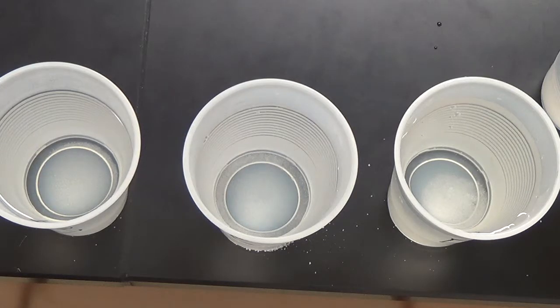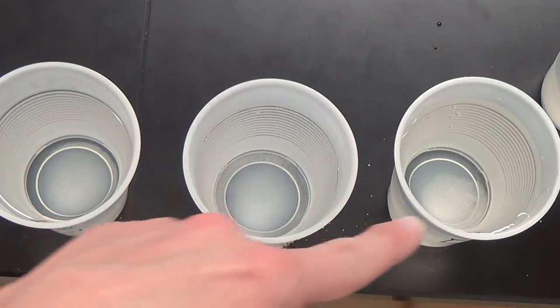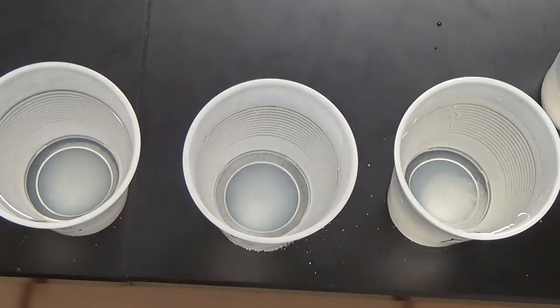Yes, I'm still here. We have about a minute to go. I'm still seeing a few grains in this cup. Still seeing more than a few grains in this cup, and still seeing quite a pile in that cup. So we're about to wrap this up in like 45 more seconds, but I have not really seen any of these completely dissolve like I have the others.